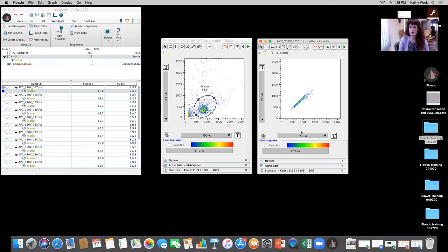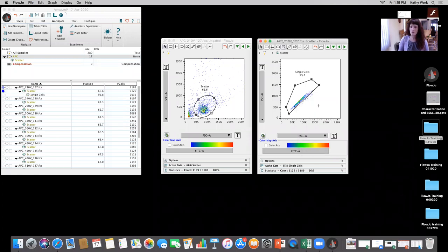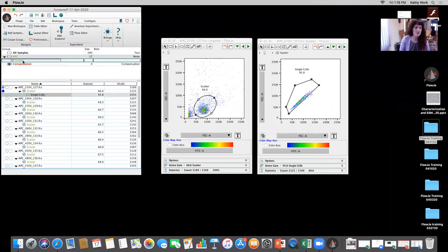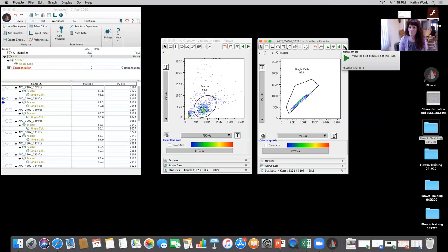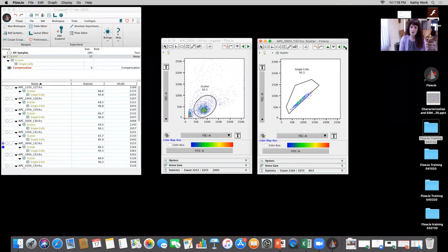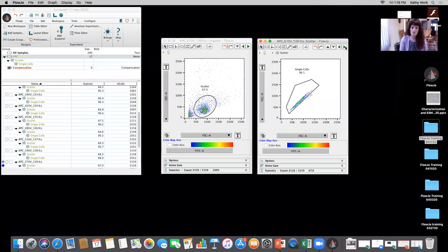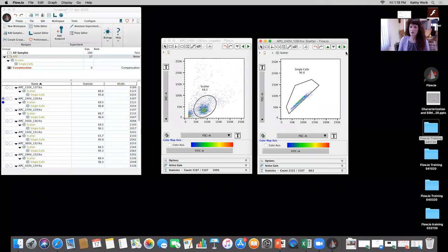I'm going to make that gate a little bit bigger, then drag the scatter gate up to all of the APC group and double click on it so it only shows pre-gated events. For side scatter area, I'm going to change that parameter to forward scatter height to use as a doublet discriminator. Using the polygon tool — each click is a node — I'll create a single cell gate. Once dragged up to scatter, it becomes a daughter of that scatter gate and applies to all individual samples.